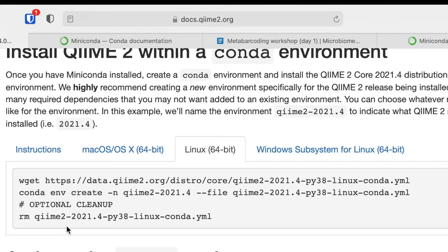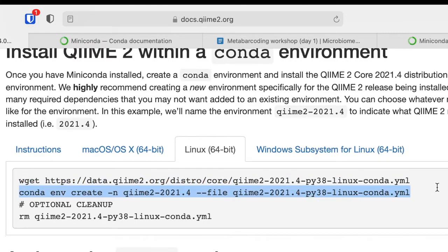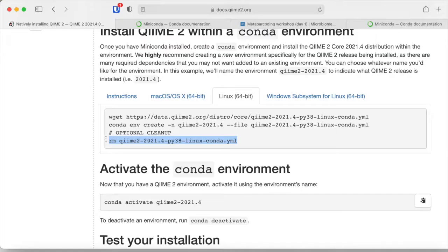This is a three-step installation. First, we download a configuration file with all the packages needed to create a new environment with QIIME 2. Then we create an environment using Conda or Mamba. And finally, we can remove the file that was used just as a template. This is different than installing a package from Bioconda, like with conda install -c bioconda, but ensures that all the versions of all the libraries and dependencies are tightly controlled.